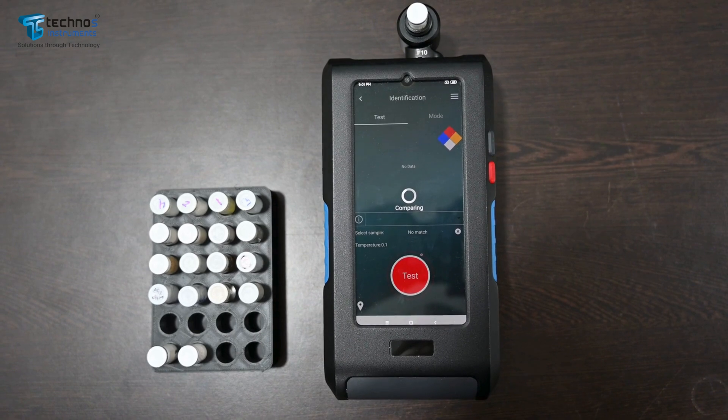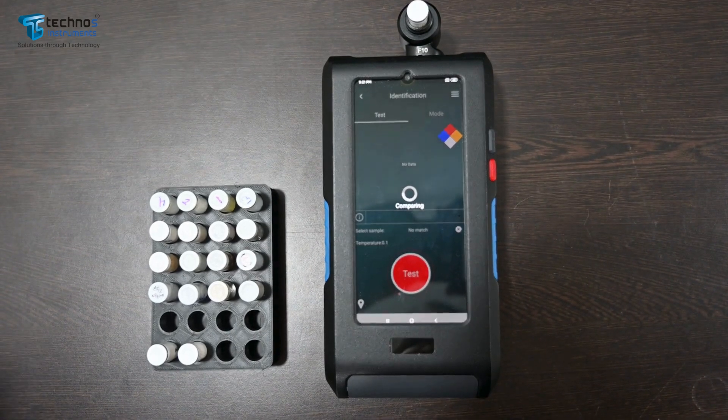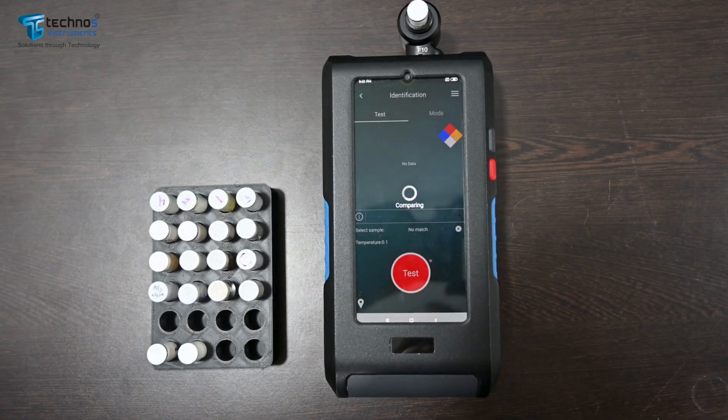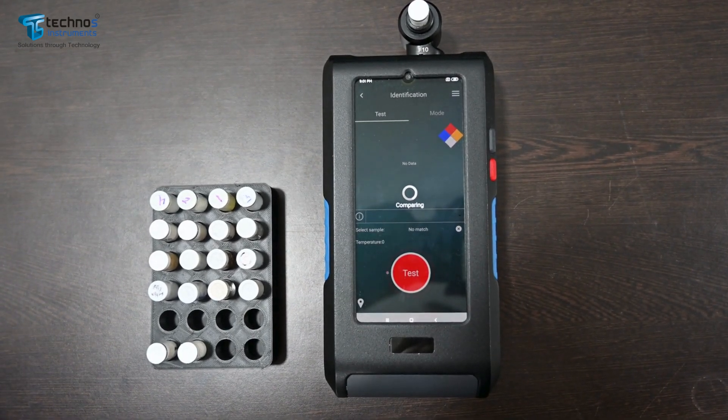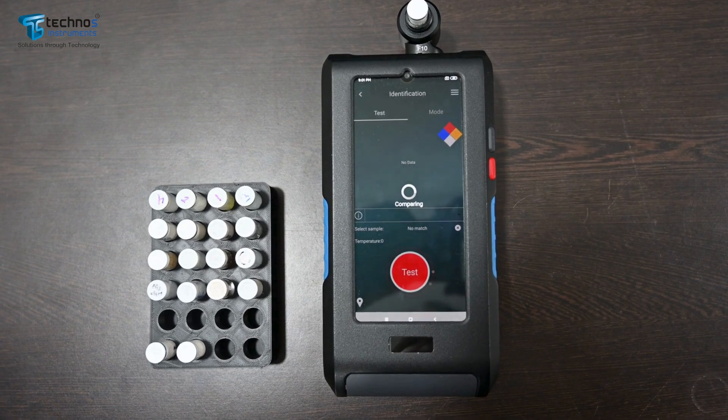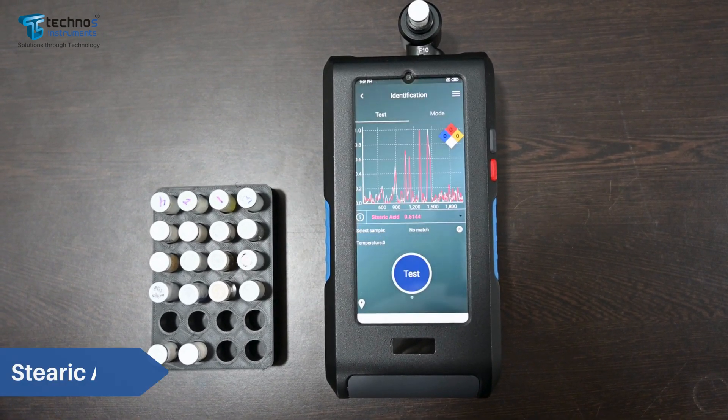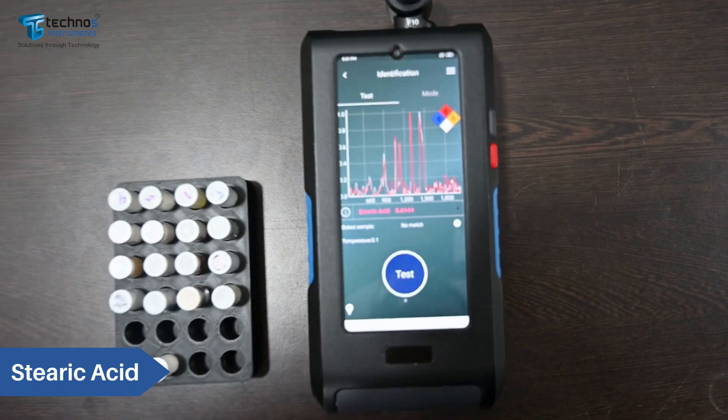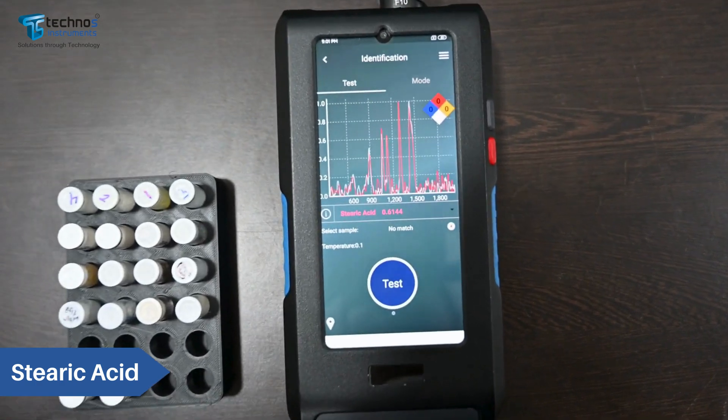Comparing with the library. And you can see the data.